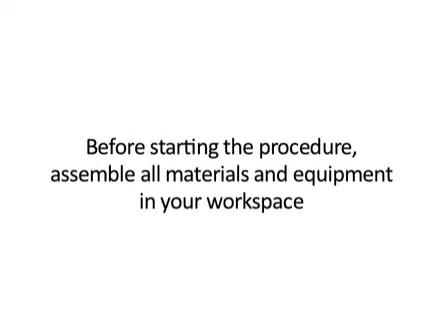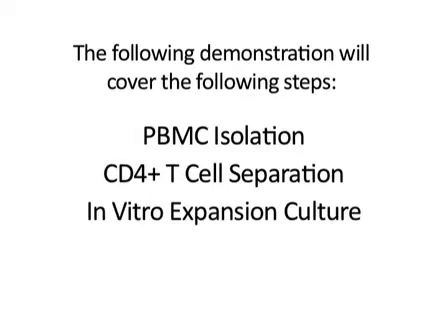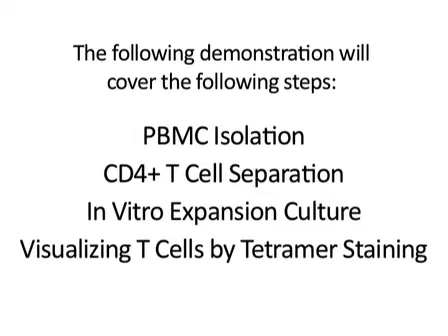Before starting the procedure, assemble all materials and equipment in your workspace. The following demonstration will cover the following steps: PBMC isolation, CD4 positive T cell separation, in vitro expansion culture, visualizing T cells by tetramer staining.